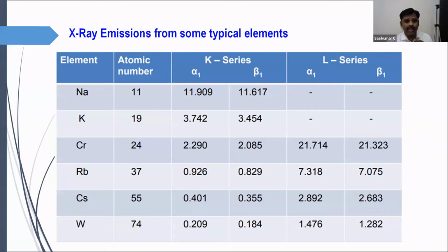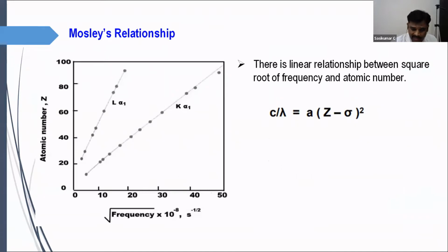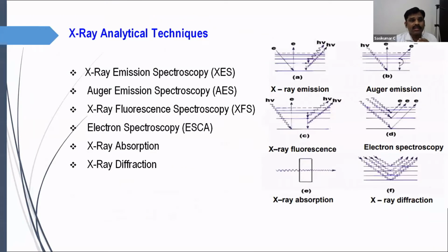There are basic relationships, in accordance with the atomic number, and the X-ray coming out can be used for a number of applications and various purposes.